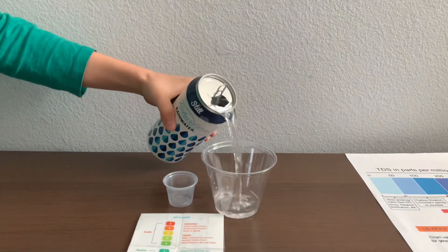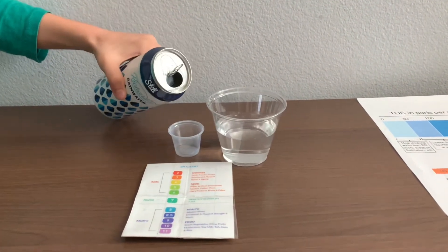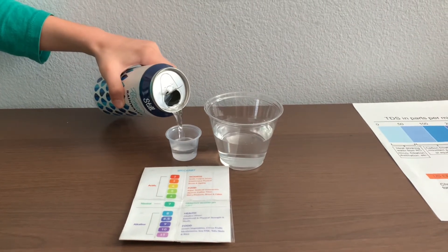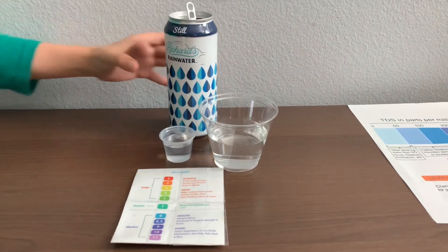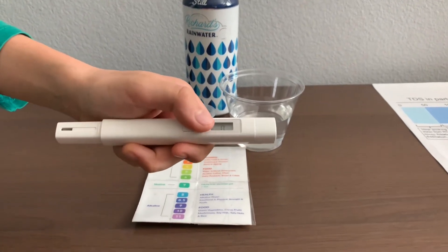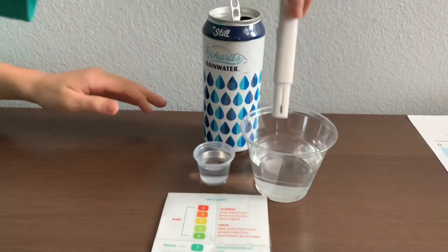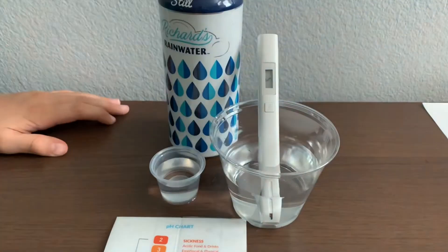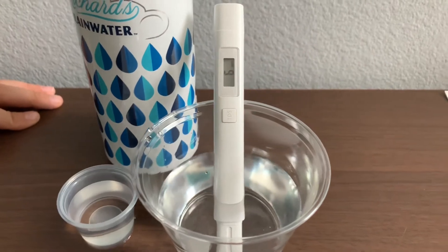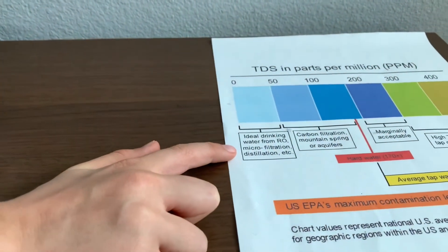Let's pour some water in. First, let's test the TDS level. Turn on the TDS tester, make sure it says zero, and put it in. It is a six. That is microfiltered and distilled water.